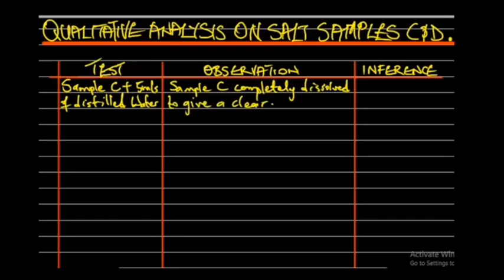Since it's completely dissolved, it informed us that a soluble salt is present there. Soluble.